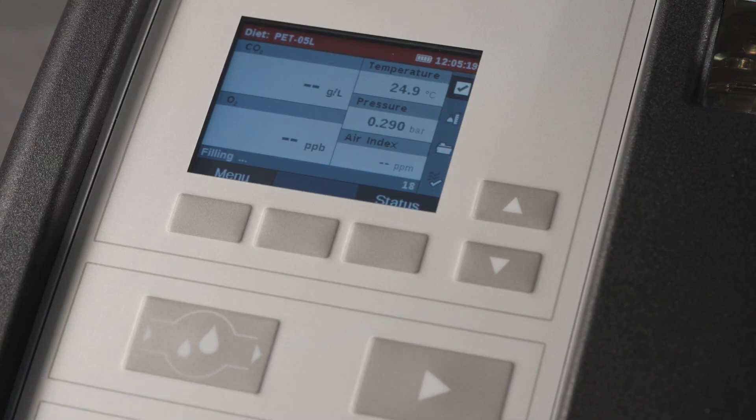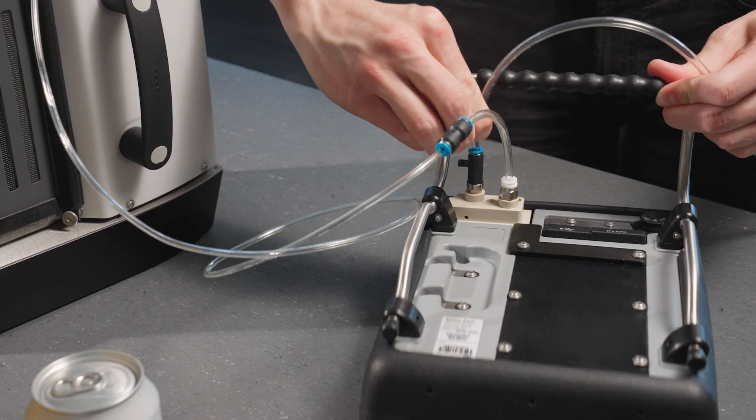Start the measurement. If the filling pressure is too low or bubbles appear in the measuring chamber during measurement, check the gas supply pressure and verify all connections.